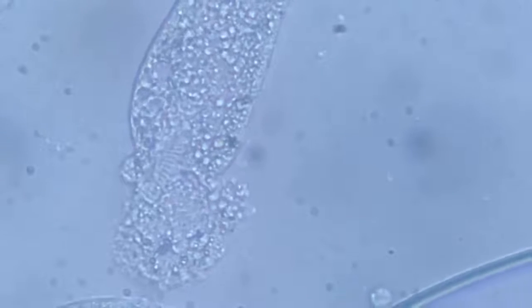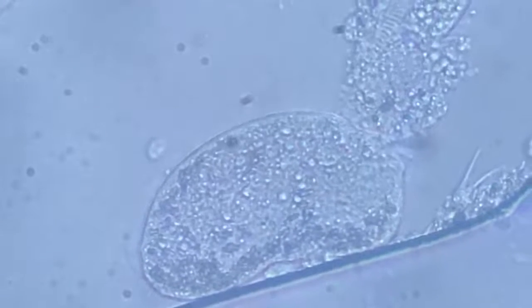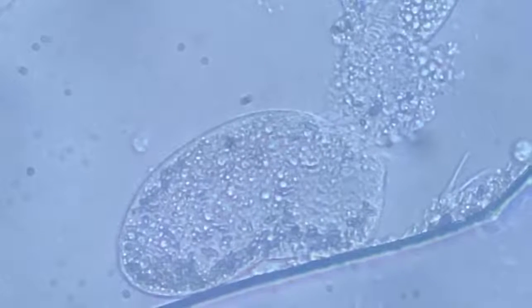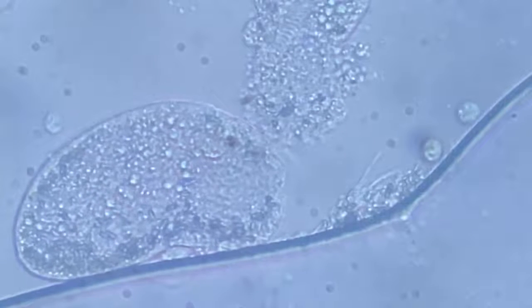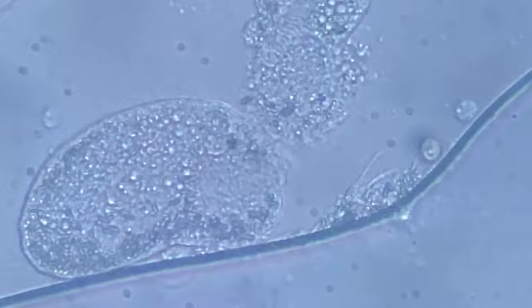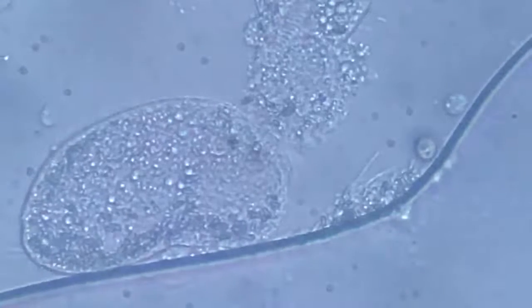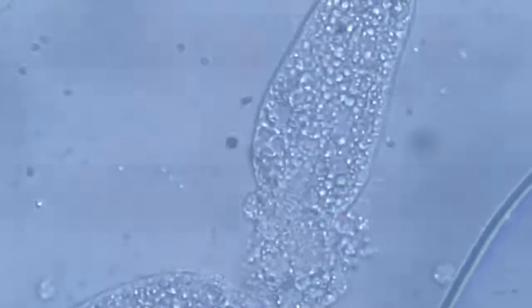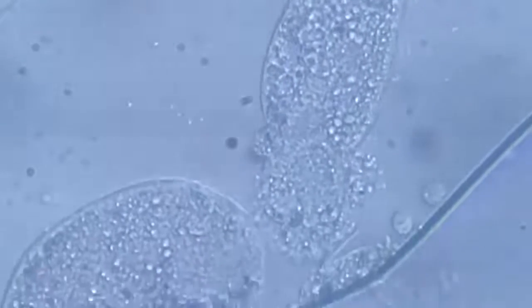The cilia are still beating as it has died. You can see the ciliary fragments down at the water air interface. It has been a death of a different sort. The cilia are still beating while the anterior part is gone.